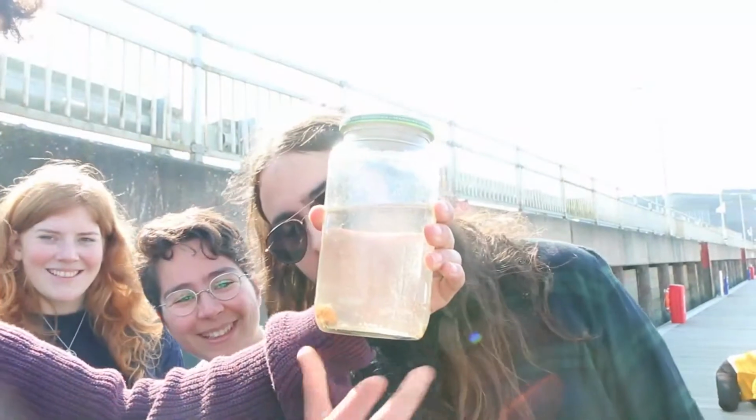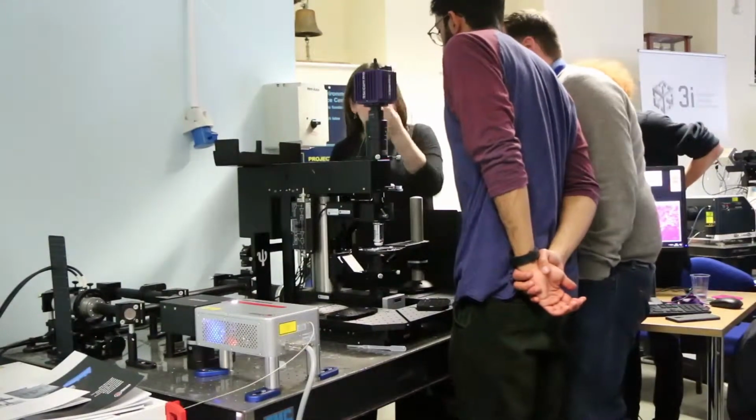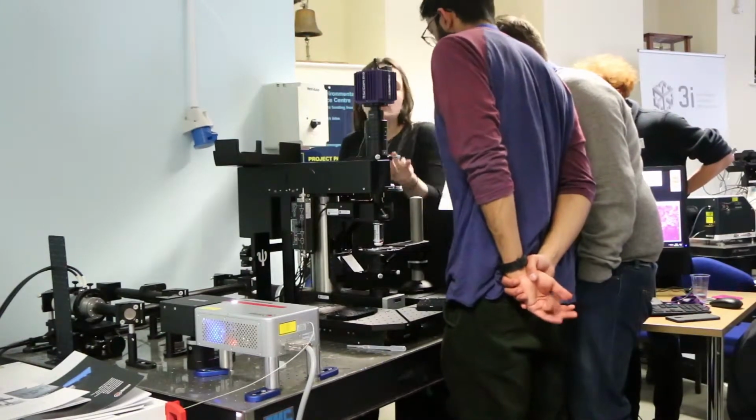It's a course aimed at people using especially light microscopy in the cell biology field. We're aiming at PhD students and postdocs who are either biologists or physicists who want to develop a better understanding of modern microscope techniques. The things we're looking for are how much of a benefit it would be, and also whether they're in a position where they'll take knowledge back to the host institute.